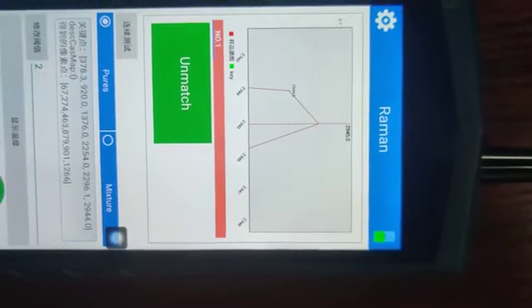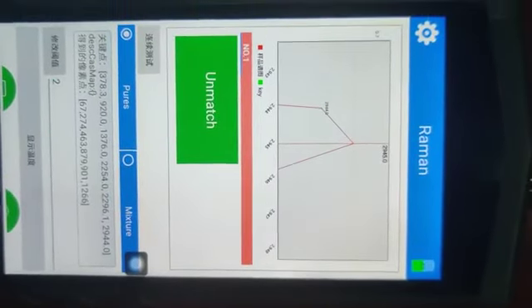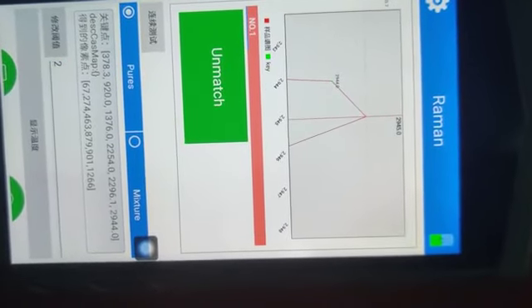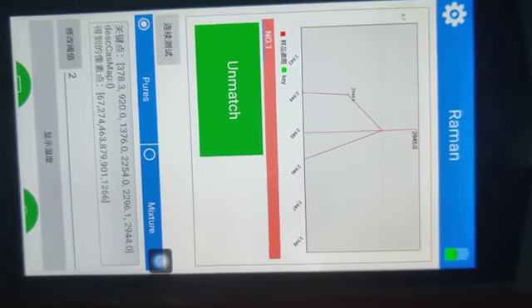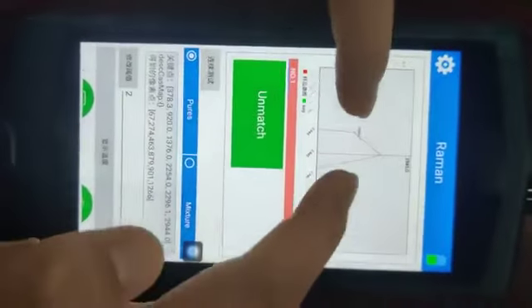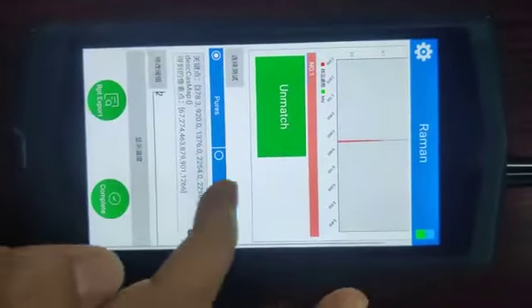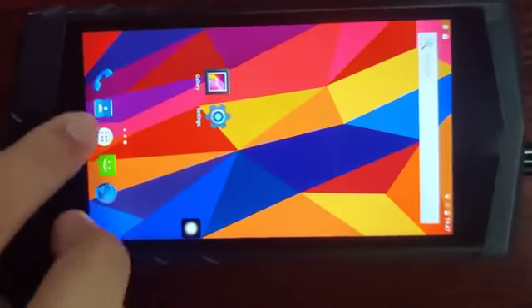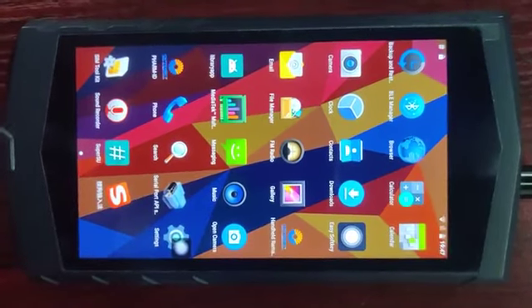But if you find it's difficult to make all 5 peaks exact, and you just have one wavenumber difference, you can just neglect it and complete this calibration. Okay, so completed. That means the calibration is complete, and you can run the pharm ID.